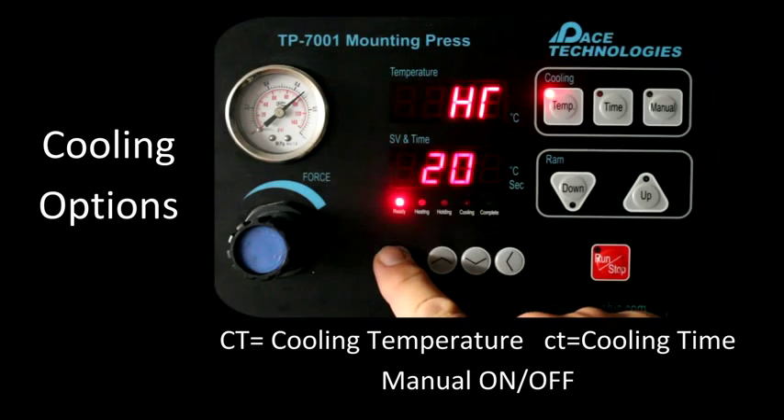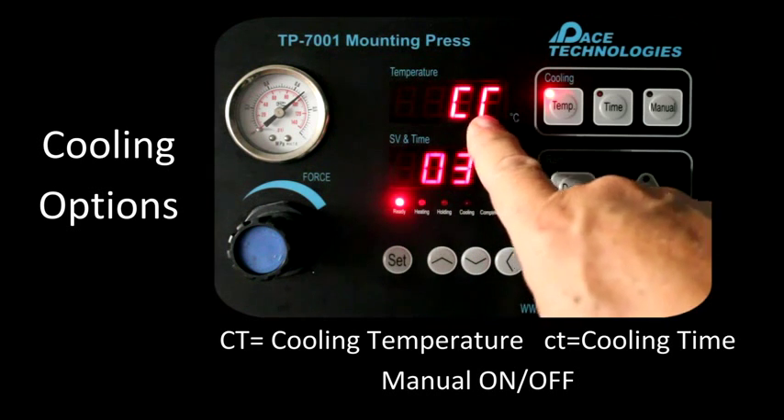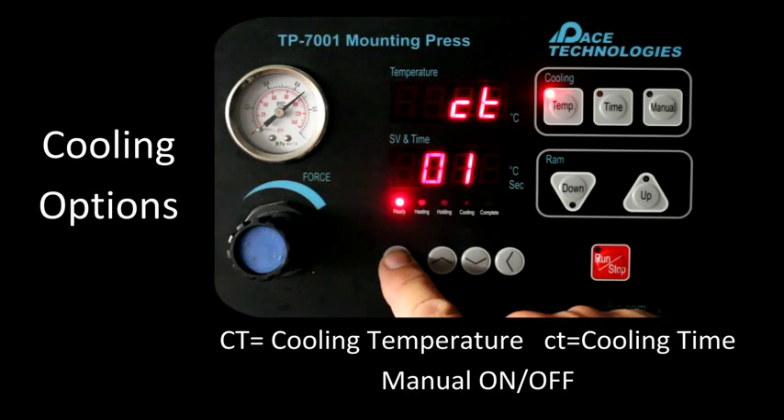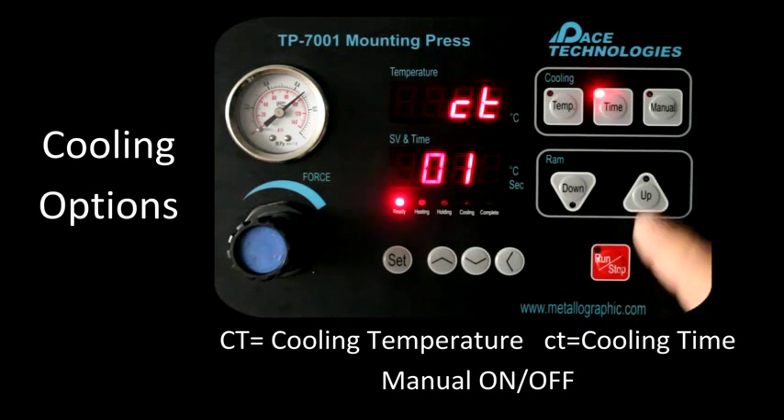There are three cooling options with the TP7001. The first is cooling to temperature. The second is cooling for a specific amount of time. And the third is manual cooling.